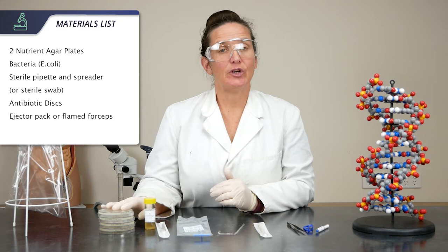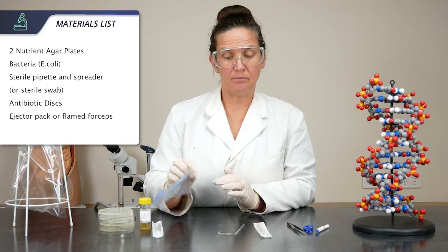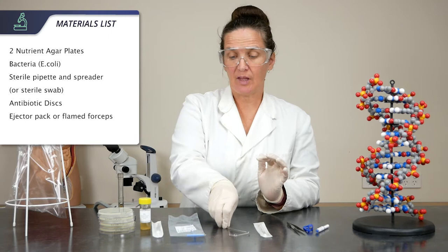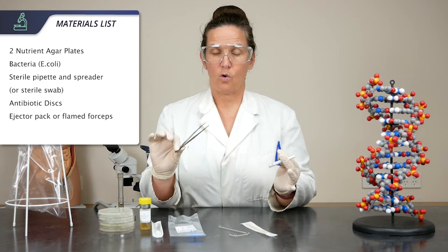For this practical you will need two nutrient agar plates per student. I've got four because I'm going to teach you two different techniques. Your bacteria, a sterile pipette, a sterile spreader, or conversely a glass spreader if you prefer. The other technique uses a sterile swab, antibiotic discs, which can be taken out using either an ejector pack or flamed forceps.